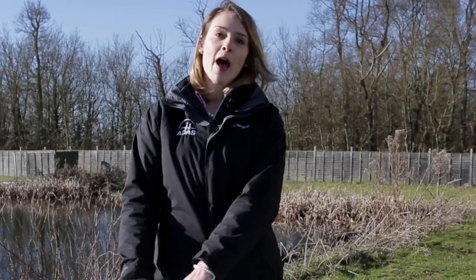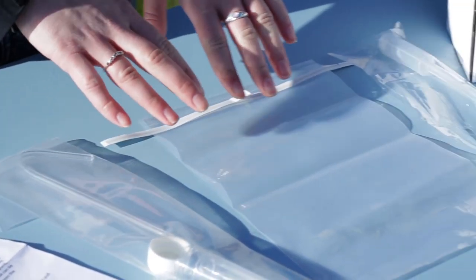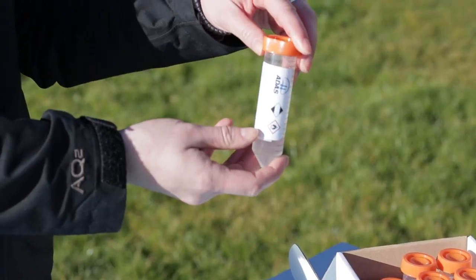Your kit includes a protocol sheet, a sterile 30 milliliter ladle, a sterile wool pack bag, a sterile plastic pipette, two pairs of sterile gloves and six conical tubes two-thirds full of preserving fluid.